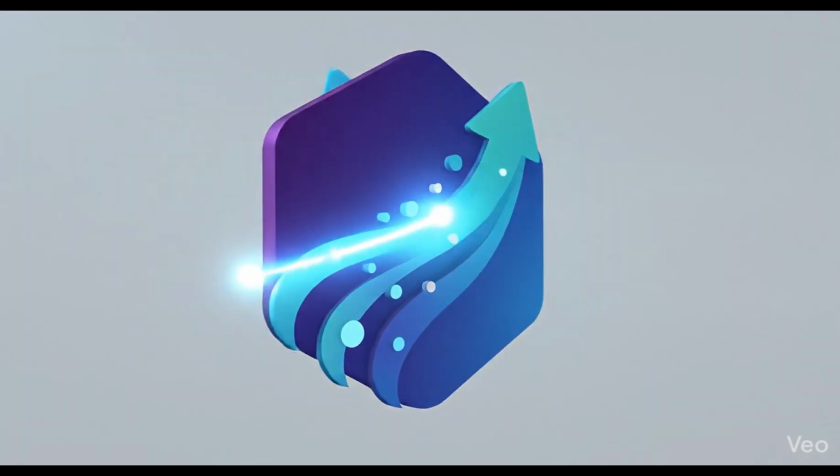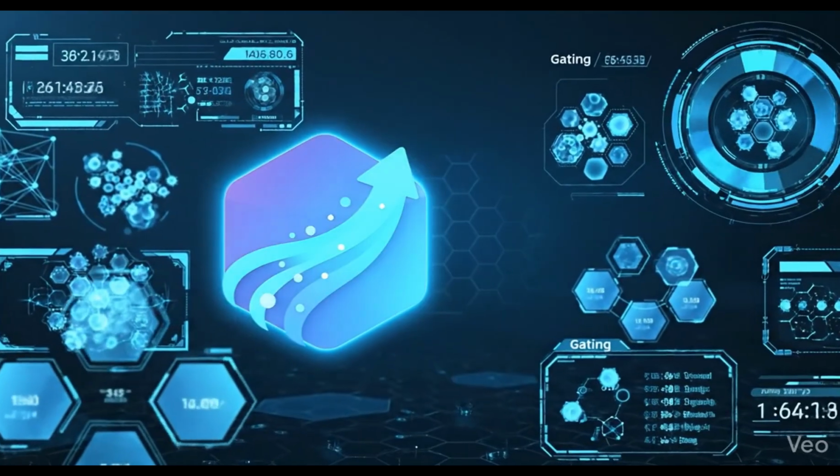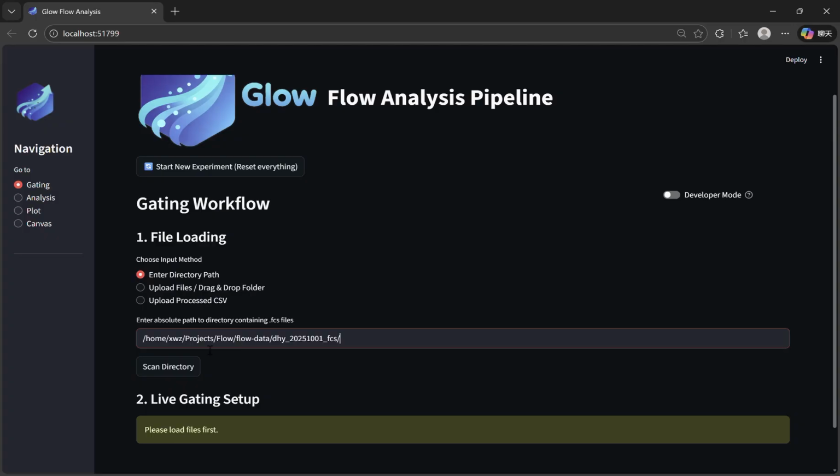Hi, this is Glow, a flow cytometry analysis pipeline featuring a clean UI and active learning. In this quick demo, I'll walk you through an end-to-end workflow. First, let's look at file loading.